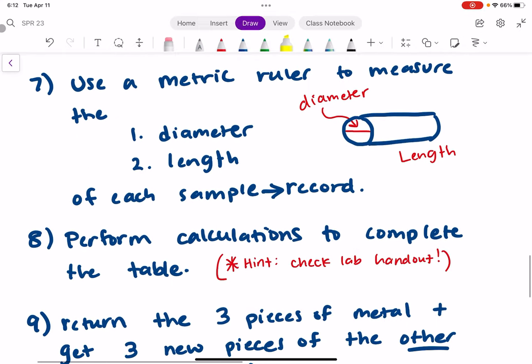In step seven, you're going to use a metric ruler to measure both the diameter, which is this here, and the length of your sample of each sample. And then you're going to record those values.